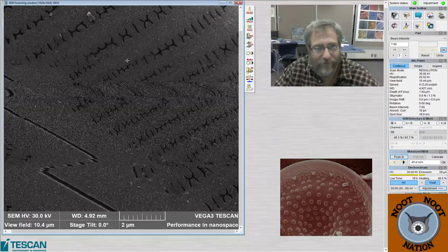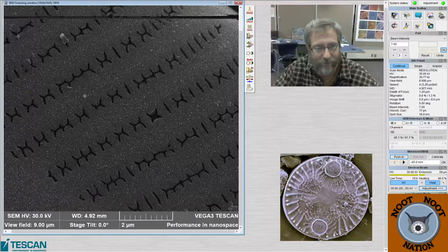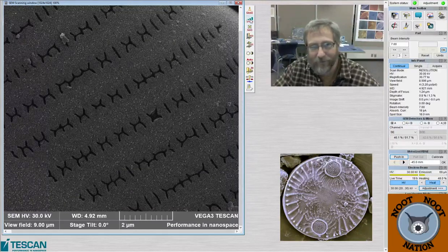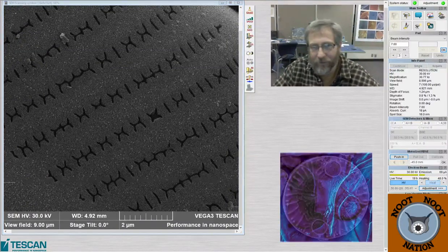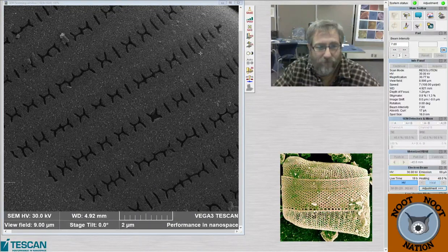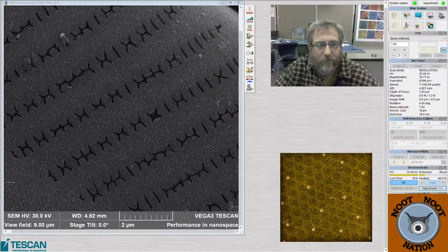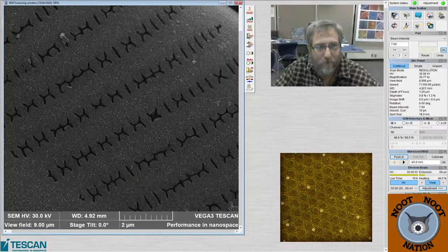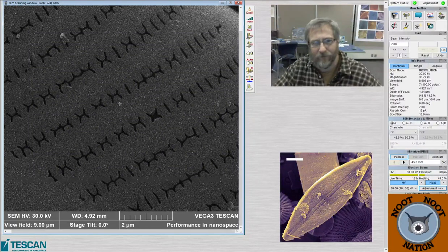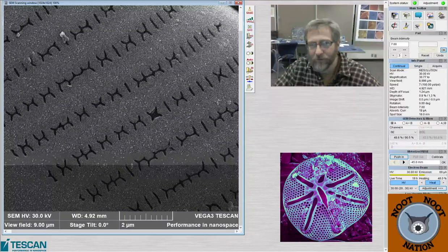So I'll zoom in and take a picture of the Space Invaders sort of model we got here. I want to get enough of it, but not too much of it, which is always the case. It's a problem trying to get the right amount of what I want to see. And then I think we can do that because it's a little bit dark. Take your time, scope. Get it right. Good. Okay.